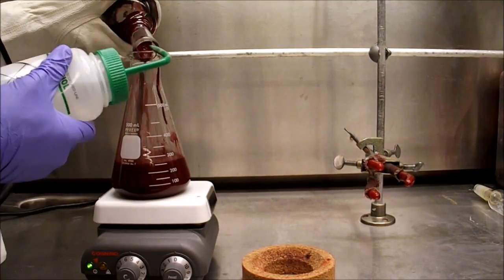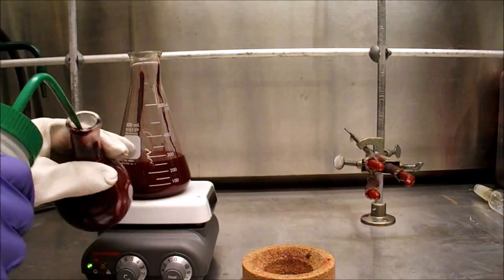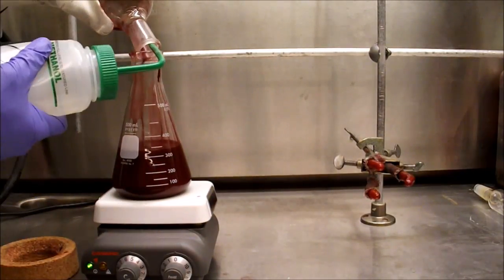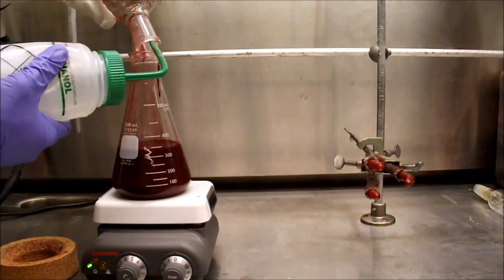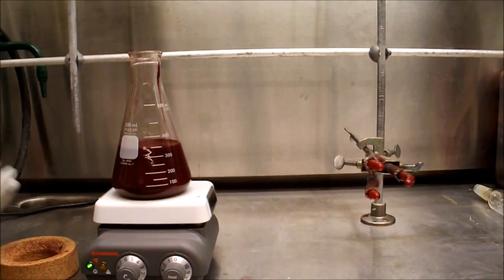In order to transfer all the reaction mixture to the Erlenmeyer flask, the round bottom flask is rinsed with methanol. Thanks to the very low solubility of ethylpropyl PDI in methanol, a large amount of methanol can be used in this rinsing step without having to be concerned about losing product.